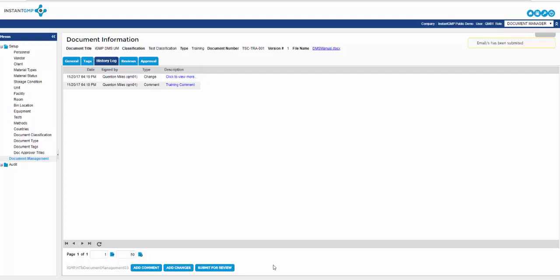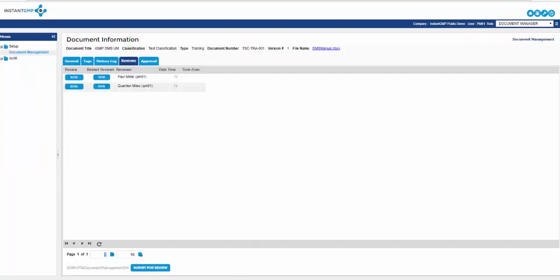We've made our changes and now it's time for review. Click on the Review tab and sign, signifying that we've reviewed everything. If I wanted to restart the review process, I would sign under Restart Review. Click on the Approval tab. There are a few options. If everything is good to go and I'm ready to approve, I can sign using the Approve button. To restart reviews or to restart approvals, I would sign there.